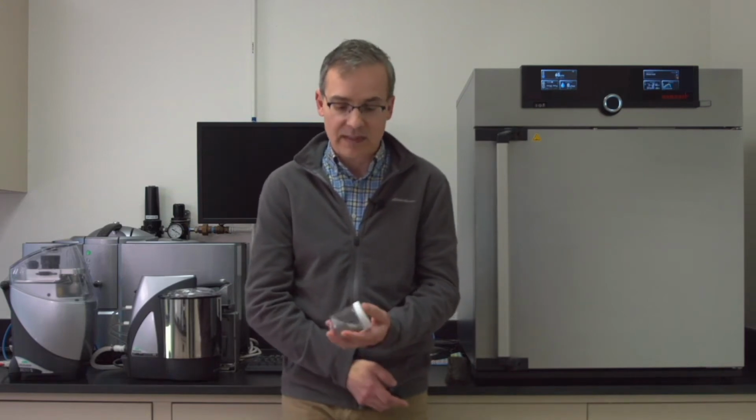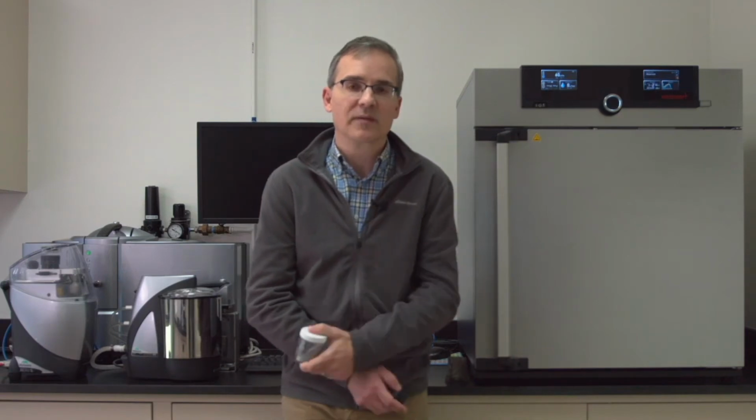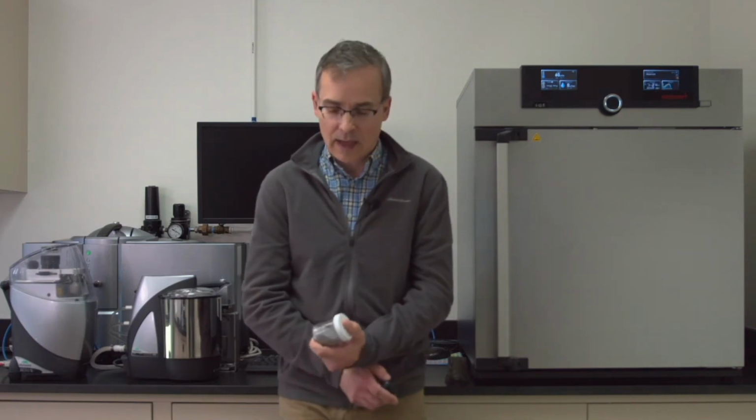The materials consist, I think this one's pretty heavy. This is probably a nickel super alloy, which would be used for high temperature applications. Other common materials include aerospace and medical grade titanium alloys, stainless steel alloys, cobalt alloys for medical devices and other high wear resistant applications, and then lightweight alloys like aluminum and magnesium alloys.